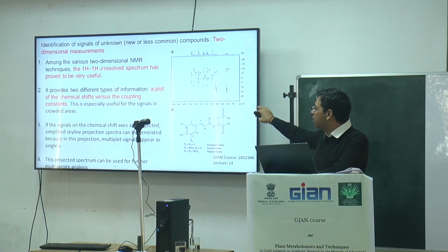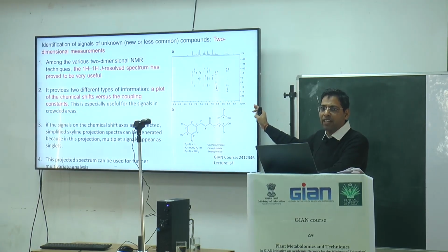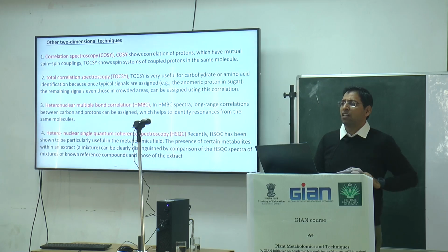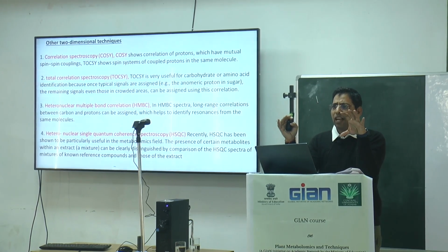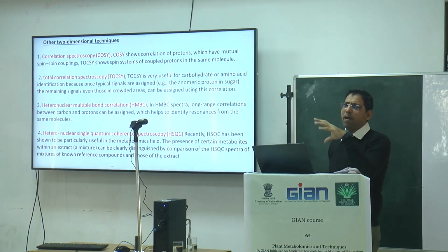These plots are a little bit different from the previous one, in which you were only identifying a few peaks. Here you can find the singlets, and those singlets represent the different types of analytes within the sample also. So it can be used further for multivariate analysis. Now, yes, there are many different types of two-dimensional NMR spectroscopy. NMR is a spectroscopy itself, and whatever data we capture in NMR is equivalent to IR spectroscopy. So IR and NMR have a similar type of pattern here.